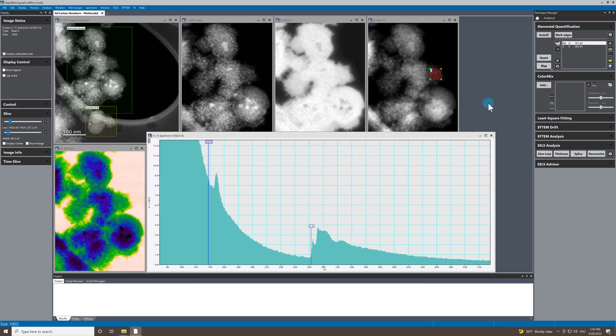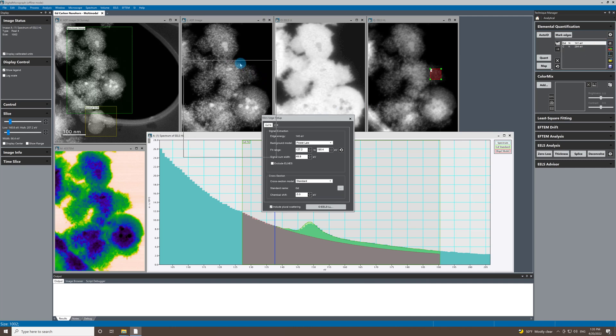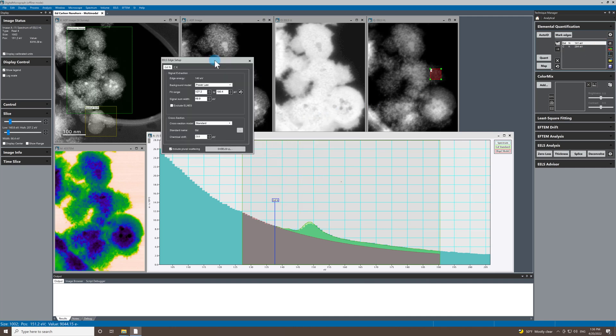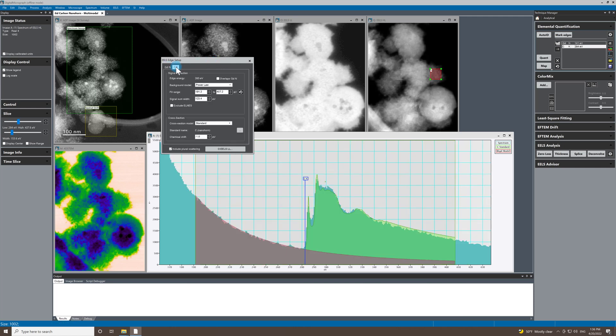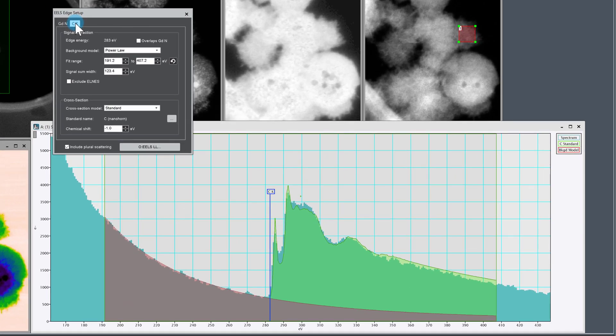So let's go and just check that the edge setup is good. The gadolinium looks fine. I'm using experimental reference for the cross-section. So that's the standard for gadolinium, and we have the ELNES as well as the tail of the edge. And then the same for carbon. So you can see that we are not excluding the ELNES and the fit's pretty good.